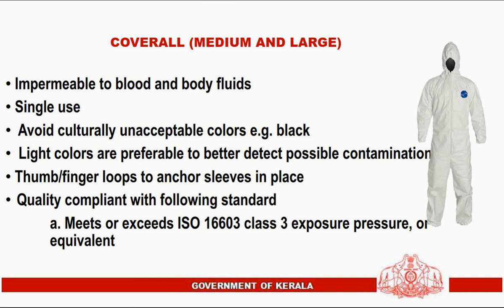Impermeable to blood and body fluids. Single use. Avoid culturally unacceptable colors, for example black. Light colors are preferable to better detect possible contamination. Thumb or finger loops to anchor sleeves in place. Quality compliant with the following standard: meets or exceeds ISO 16603 Class 3 exposure pressure, or equivalent.